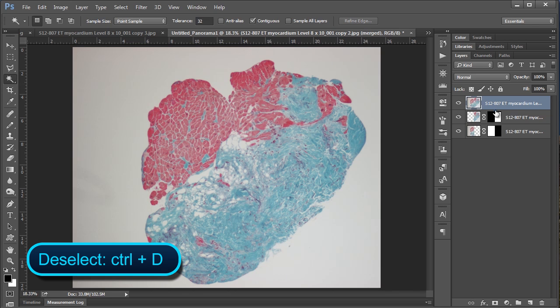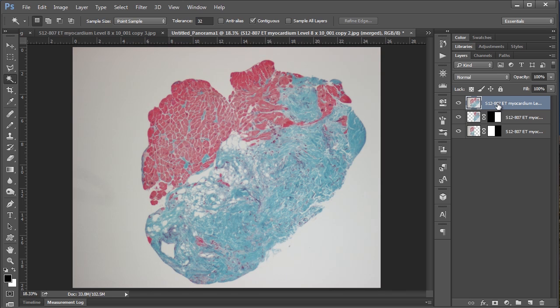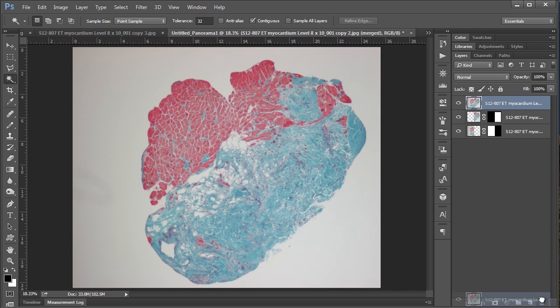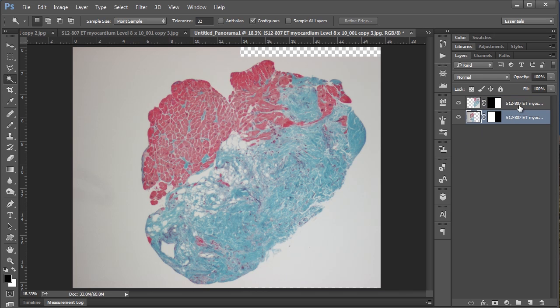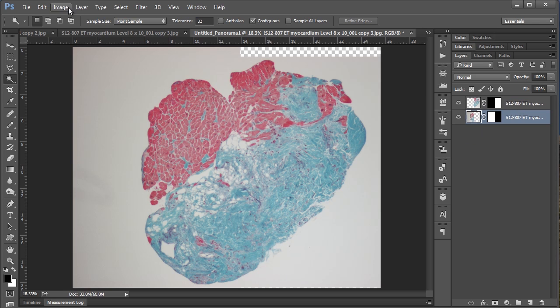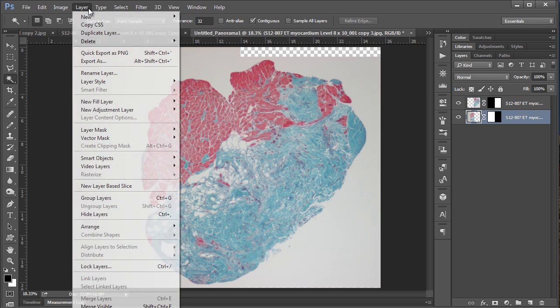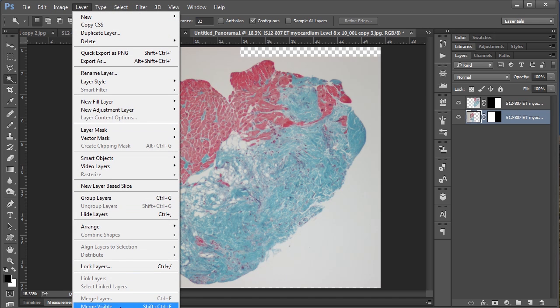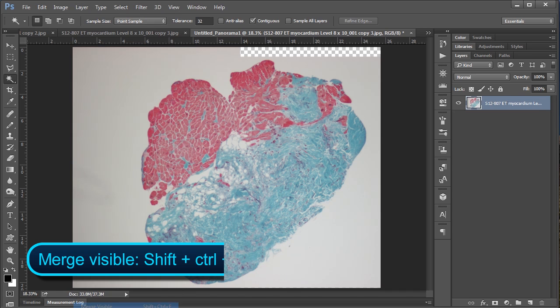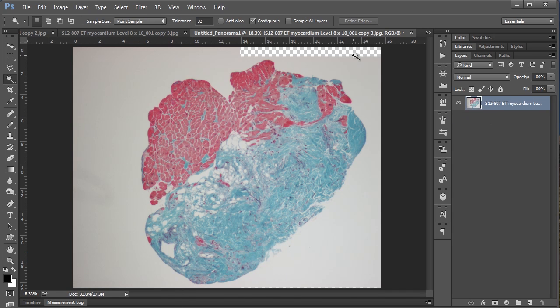And I'm going to get rid of this composite. It's got my content aware fill because I want to show you. Normally or I think if you don't use that content aware fill option you're going to get two layers like this. And all you need to do with two layers is go up to layer and say merge visible or you can press shift control E. And that's just going to merge them down into a single layer. And we'll deal with this transparent area later.